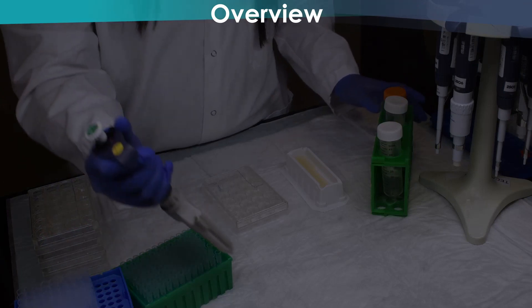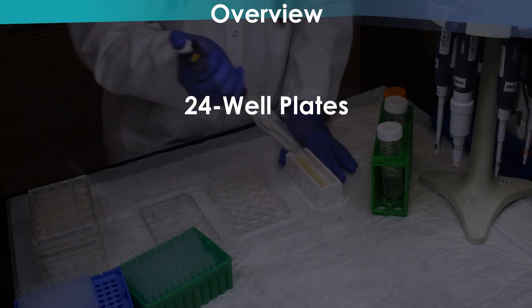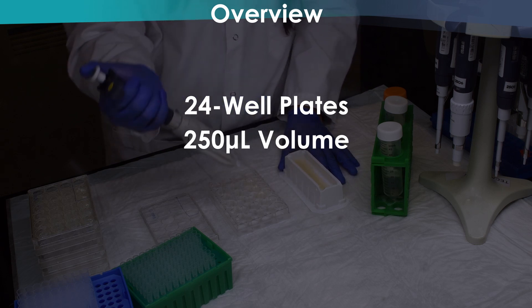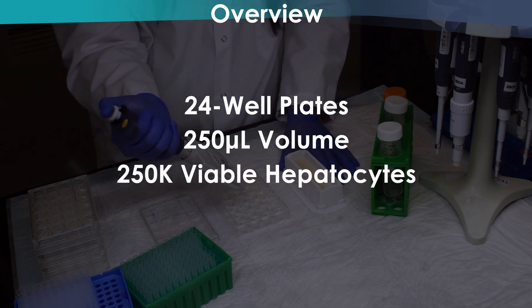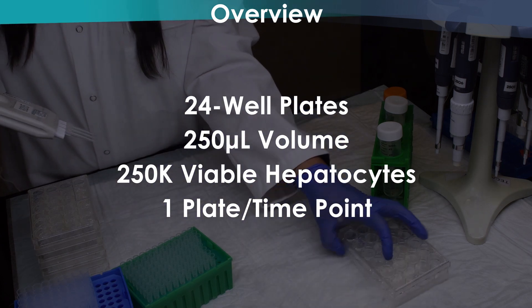As a general overview of the protocol, hepatocyte incubations are typically carried out in 24-well plates in a 250-microliter volume. Each incubation contains 250,000 viable hepatocytes, and each plate is used for a single time point of the assay and contains multiple treatments.